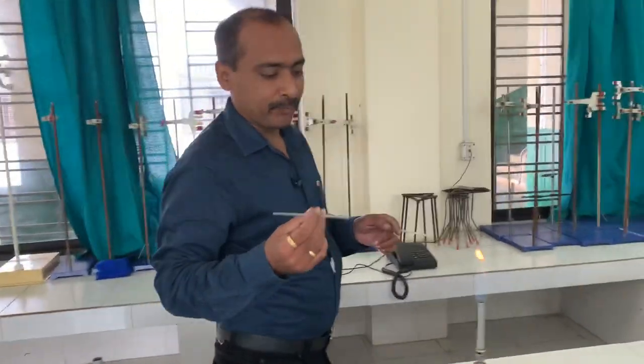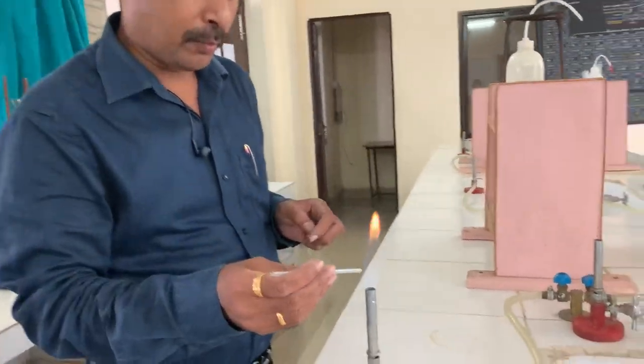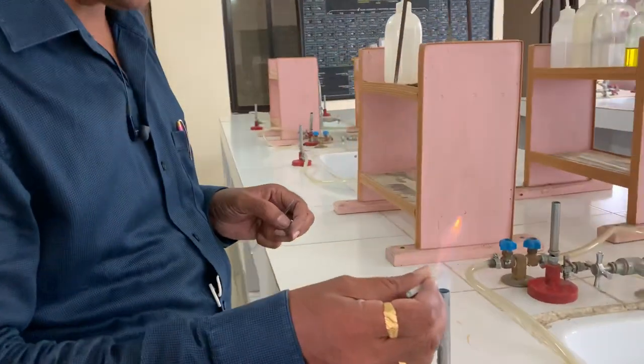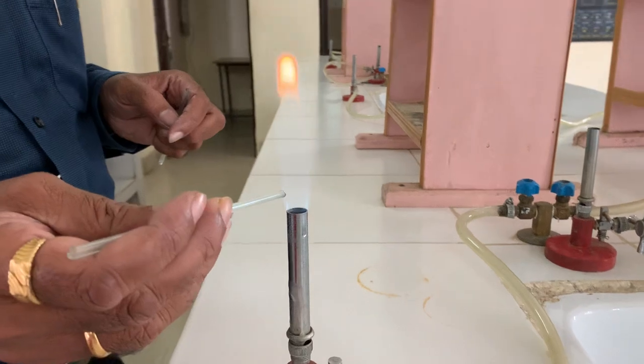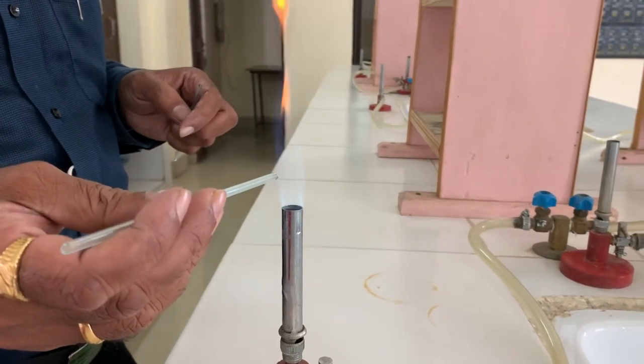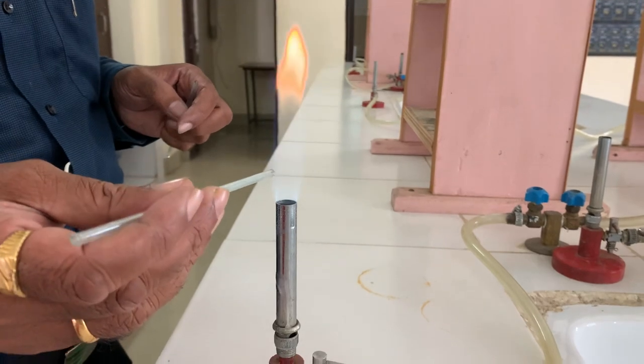You put the cut end to the flame, then that surface will be polished. That is known as flame polishing. That surface will be polished, then it is used for making a jet or making a delivery tube.